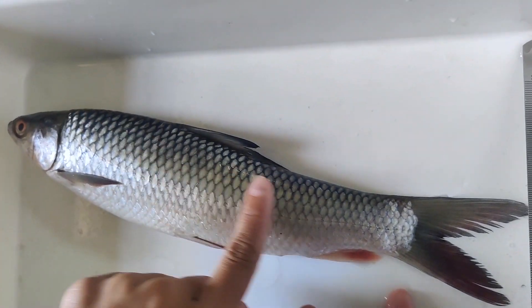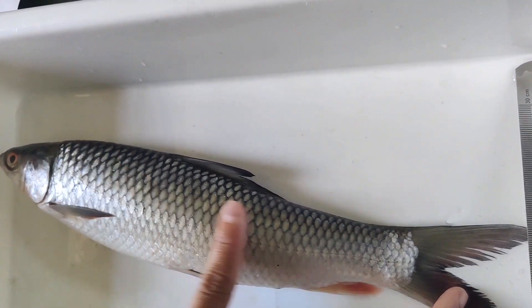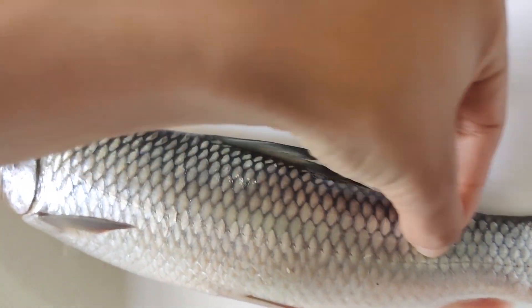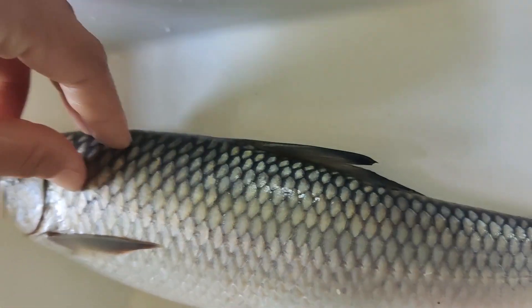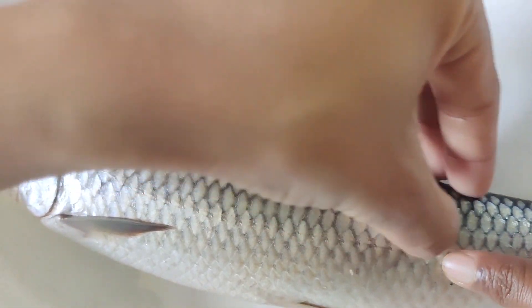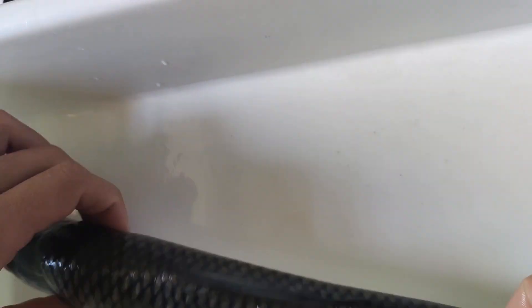This is the scale and this is the lateral line. The lateral lines are prominently seen.